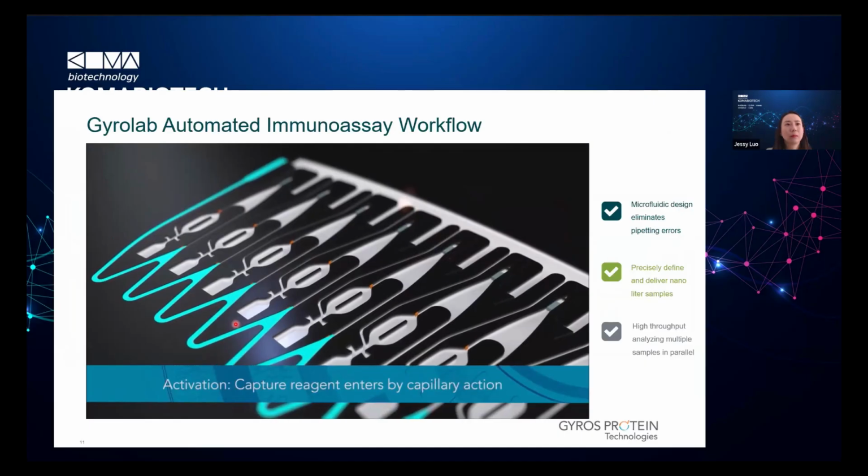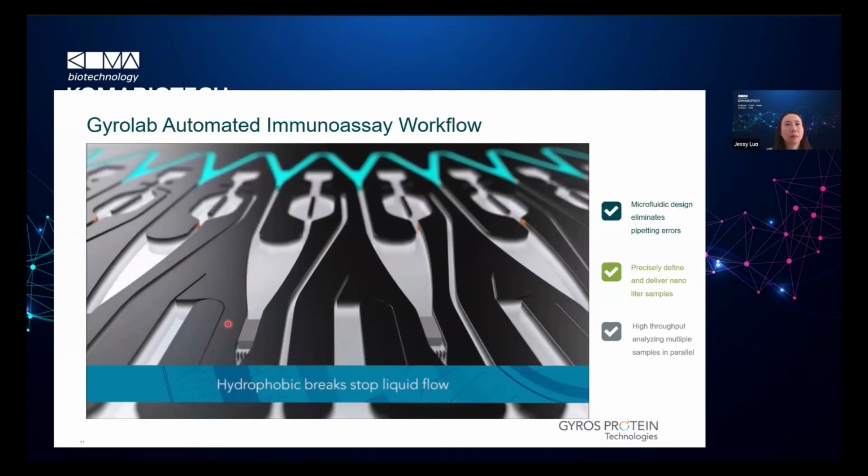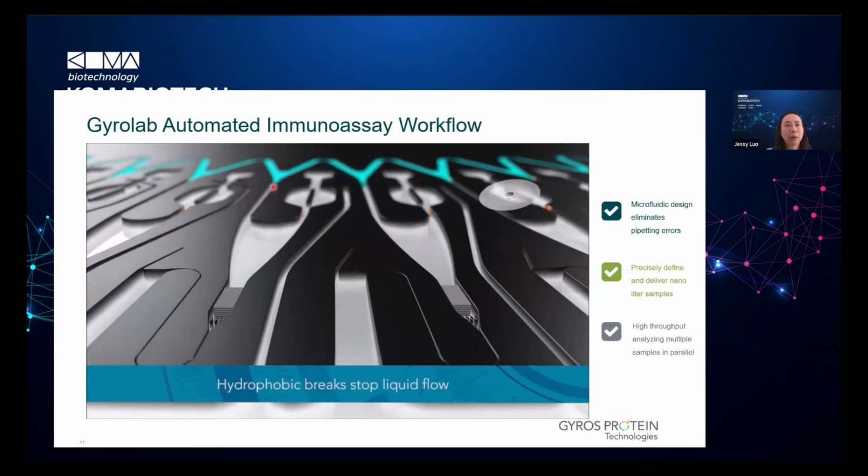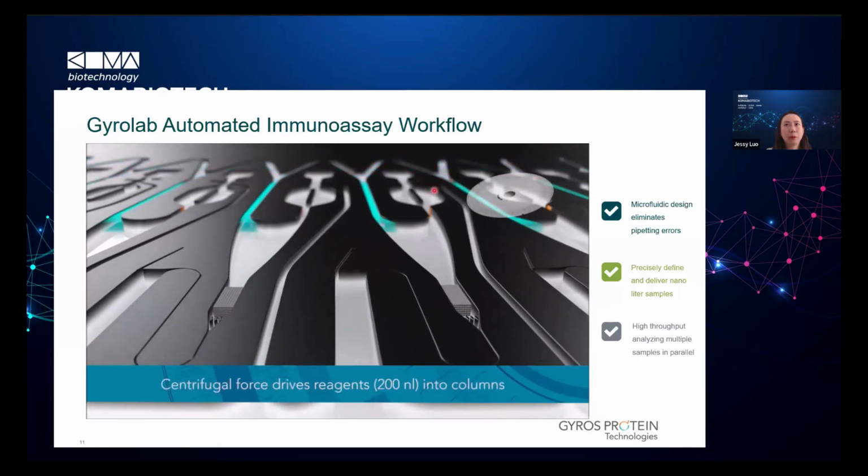Hydrophobic barriers stop the flow. Then, with a higher speed of the CD, the centrifugal force drives the biotinylated capture reagent over the streptavidin coated bead column, and the capture reagent binds to the beads.